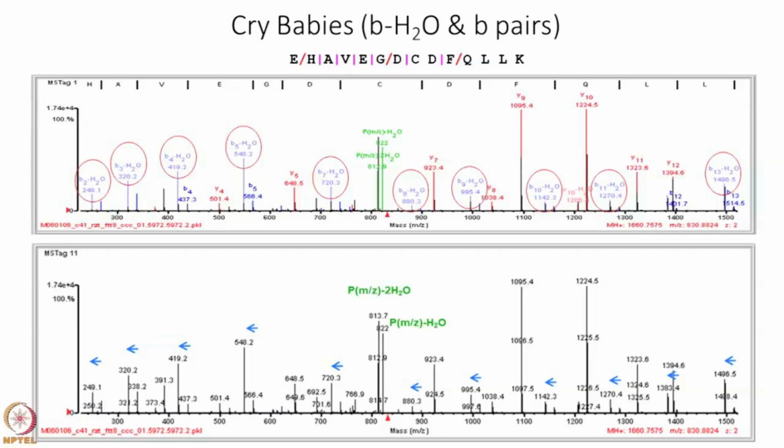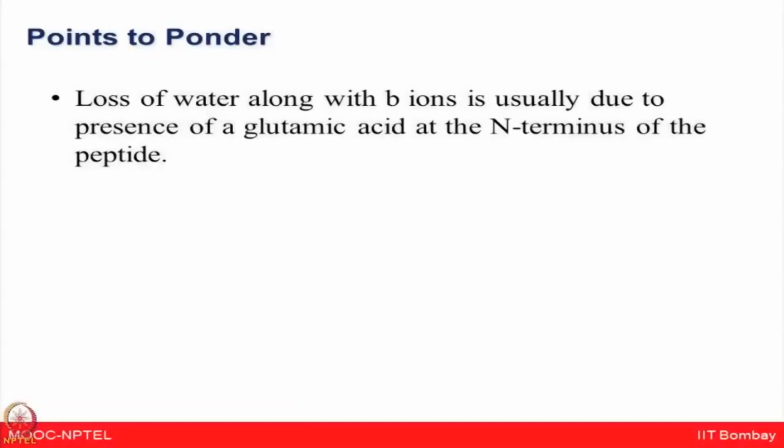The slashes I just use as nomenclature to indicate what kind of fragmentation is happening between the residues. I use a red slash to be a Y ion, a blue slash to be a B ion, and a pink vertical bar means there's both. That's not a universal thing within the field, but when you do a lot of this, it allows you to just look at the thing and know what's going on.